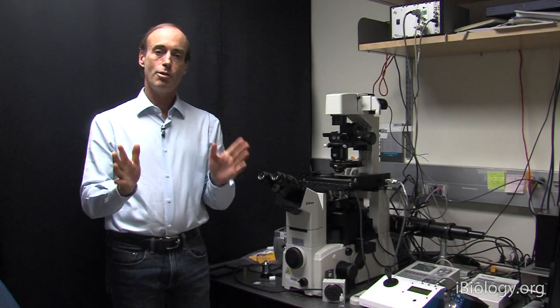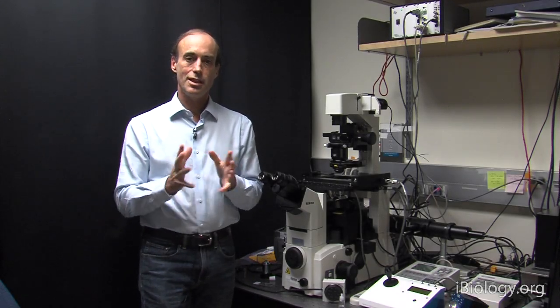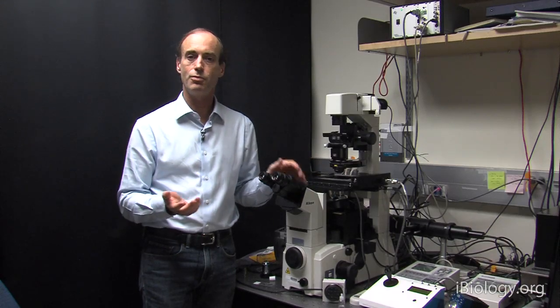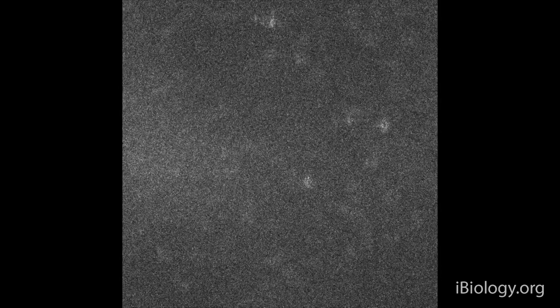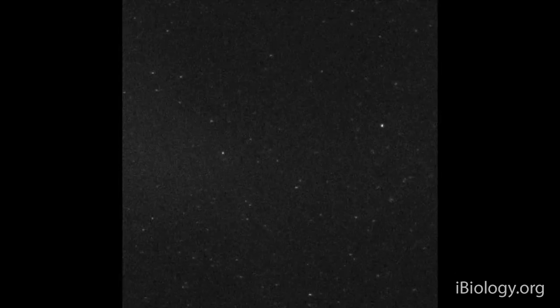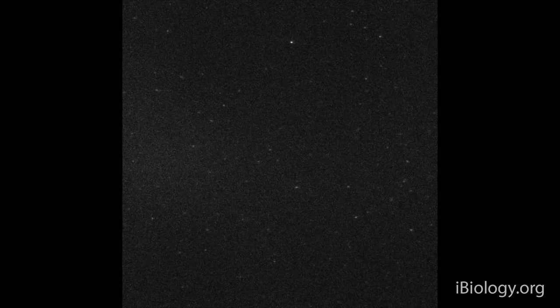So, a few more focusing tips. In some cases, you may have an extremely dim fluorescence sample, for example, fluorescence coming from single molecules.